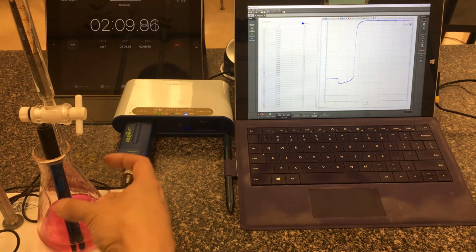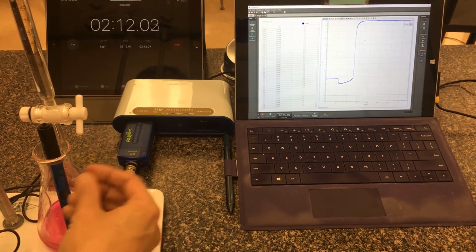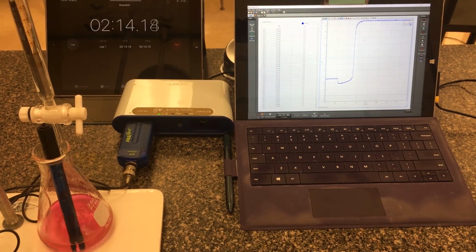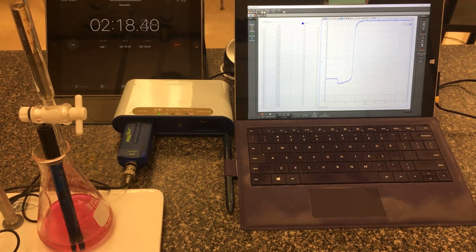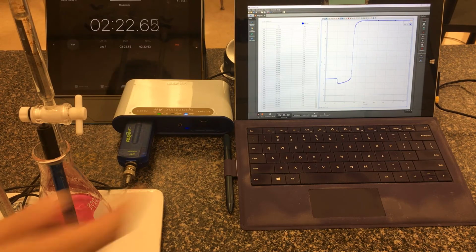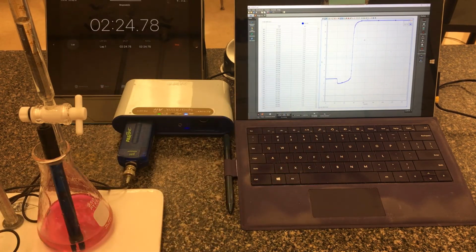So what you can do is put the drop counter here, and it can sample how many drops are dropping in. And that way we won't need to do a sort of rough comparison: how long did it take for 50 mils to drop in, and calibrate this time for us here. Okay. Again, slightly more inaccurate, but it's a little bit quicker.